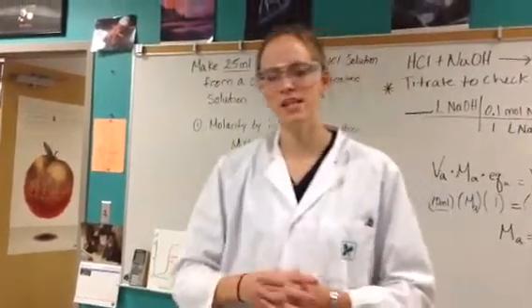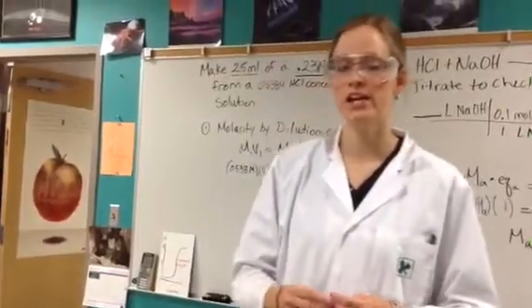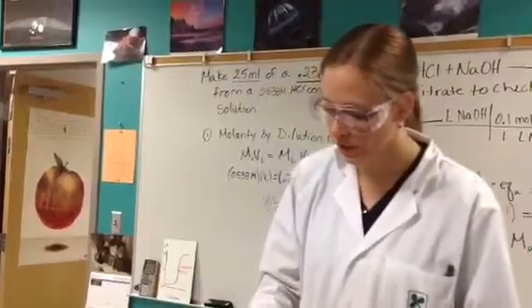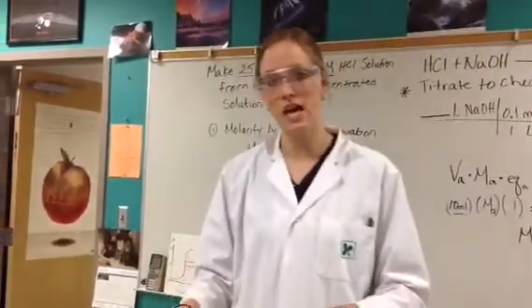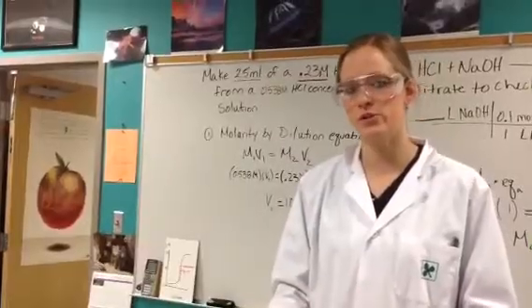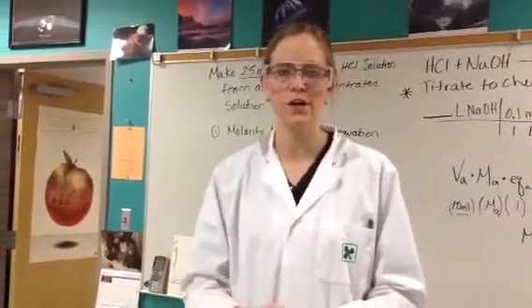Today we're going to do a demonstration of a dilution, as well as a titration to check how your dilution concentration went. When we start, we want to make sure that we have all of our glassware ready at our station. This is going to be an individual lab, just like the titration was for the monoprotic and diprotic, so you're going to need each of these pieces of glassware per person.